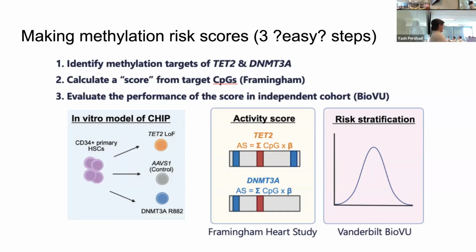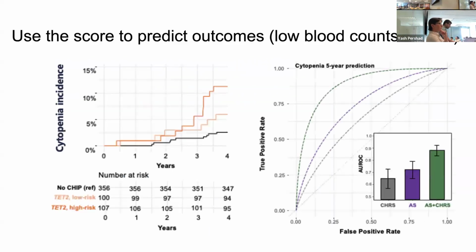And then, thinking really far down the line, let's say you find an amazing set of CpGs that predict breast cancer. Because it's a probe-based assay, you could create a custom assay that only targets the sites of interest, and that could be cheaper and easier to sequence in the future. Compared to that, if you use Epic, you'd be very fixed to that specific assay, and it would be $500 a pop. Instead, you could make your own, which is kind of cool. Yeah, that's a really good point.